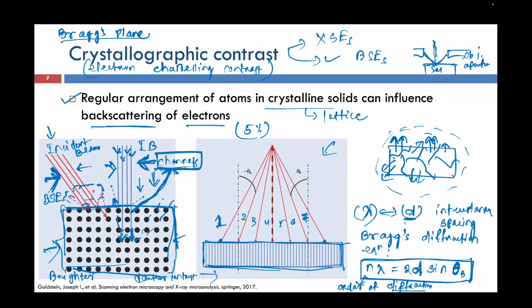Okay, Bragg's law is just about how the scattering is happening. Bragg's law tells us the condition of diffraction. Diffraction is a part of the scattering. Scattering can happen in all 360 degrees, and when a certain condition of scattering is fulfilled, then only the diffraction can happen. So Bragg's law is derived according to that. That means it will give us the condition where the scattering becomes the diffraction.